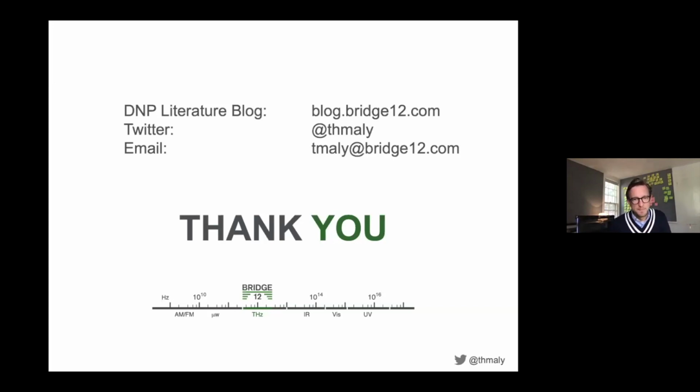All right. Our next question we have from John Blanchard, saying, almost certainly a dumb question about thermal management. Is there a reason not to just dump all of the microwave equipment in liquid nitrogen, or some other microwave transparent liquid if necessary? I was actually thinking about exactly the same thing when I was explaining the thermal management. I don't think it's a dumb question, but I'm the wrong person to ask. I would direct that question to Jeffrey Hessler from VDI and see if this is a possibility. I honestly don't know. Certainly the NMR spectroscopist way of thinking: what if we could just put it in some liquid? Exactly. Yeah. Oh, fantastic.